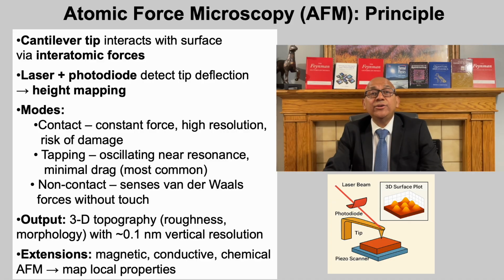This greatly reduces friction and deformation, making it the most widely used mode for polymers, biomaterials, and thin coatings. In non-contact mode, the tip never touches the surface. Instead, it detects attractive van der Waals forces through shifts in oscillation frequency, enabling non-destructive imaging even in air.